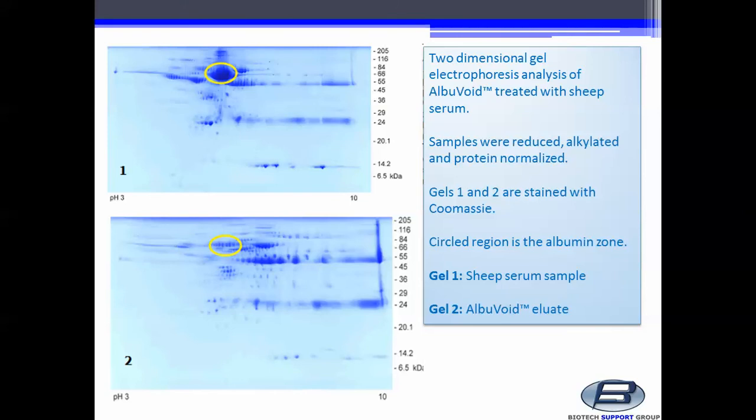Two-dimensional gel electrophoresis analysis of Albuvoid treated with Sheep Serum is displayed here. Samples were reduced, alkylated, and protein normalized. Gels 1 and 2 are stained with Coomassie. The circled region is the albumin zone.